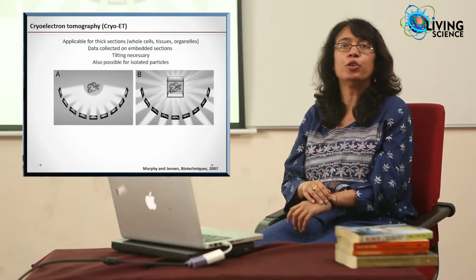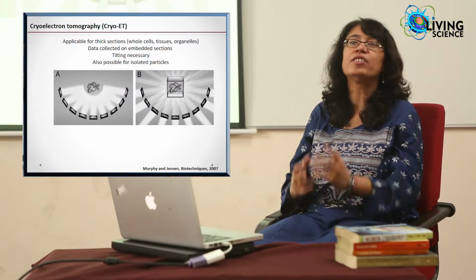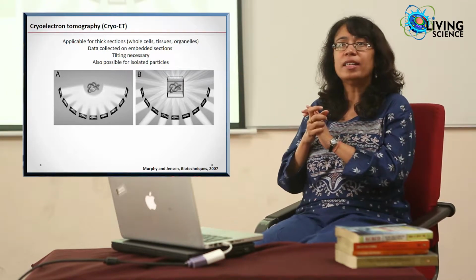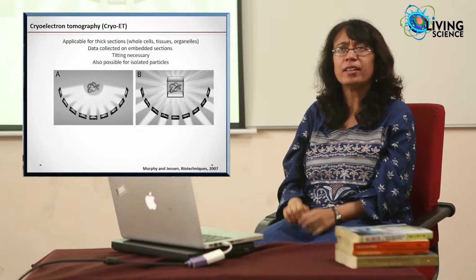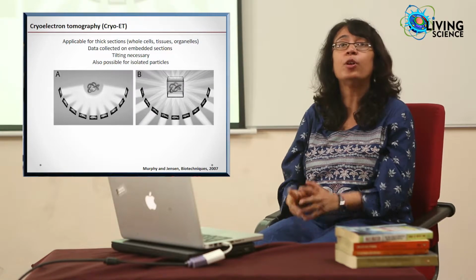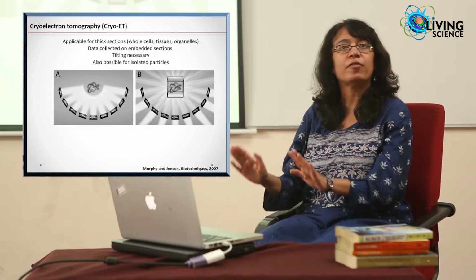Another technique related to single particle analysis or reconstruction is cryo-electron tomography, which looks at molecules in situ. Now, when we are talking about all these biological macromolecules, they have been purified from their native environment, and we are looking at them in vitro, meaning in a tube. They are not in their natural environment. Cryo-electron tomography helps people look at protein molecules, macromolecules, enzymes or viruses in their native environment within cells.